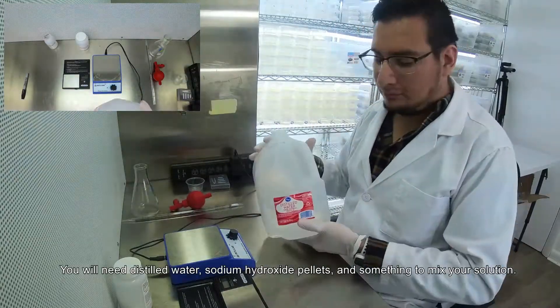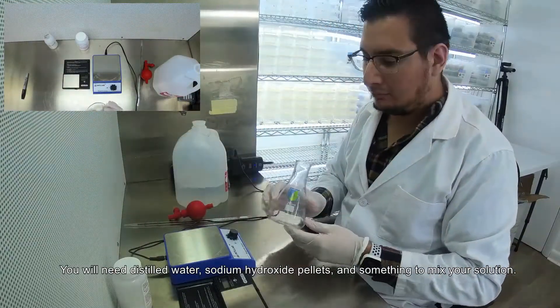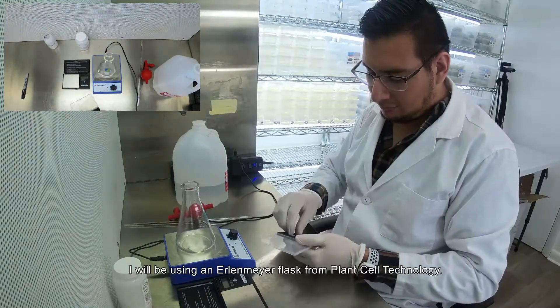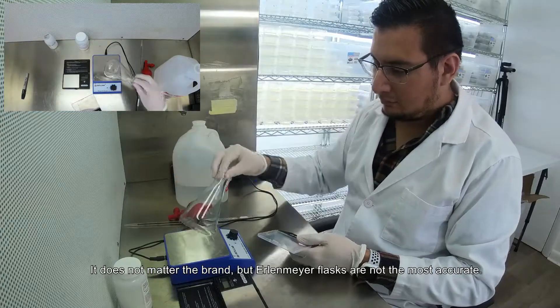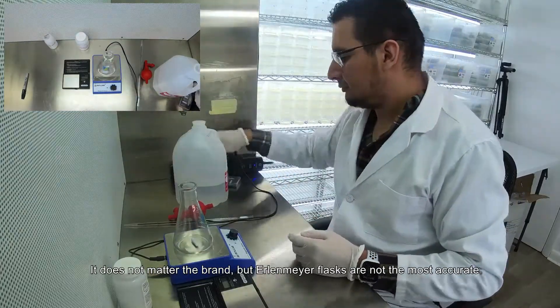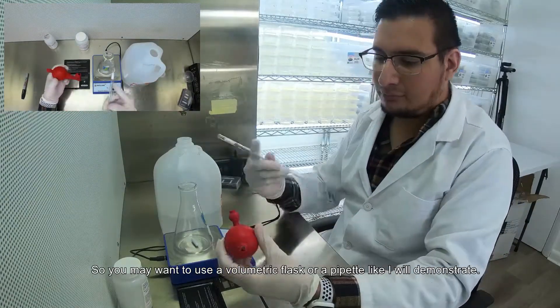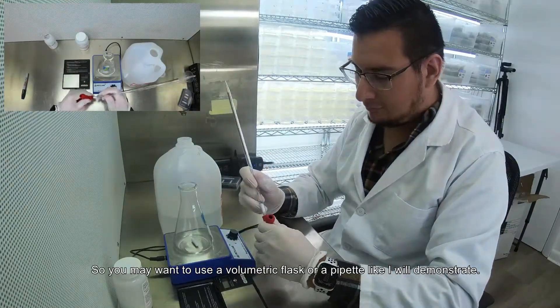You will need distilled water, sodium hydroxide pellets, and something to mix your solution. I will be using an Erlenmeyer flask from Plant Cell Technology. It does not matter the brand, but Erlenmeyer flasks are not the most accurate, so you may want to use something like a volumetric flask or a pipette like I will demonstrate.